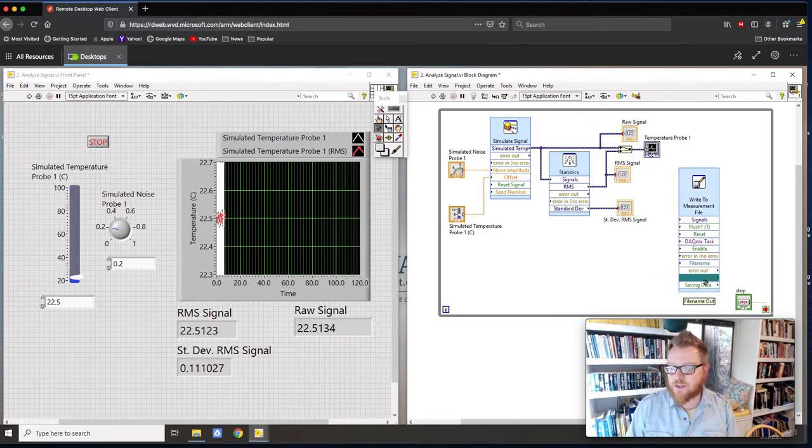And then notice this file name out is, it wants a wire from left to right, because the arrow is on the right-hand side. That's how I know it's an indicator. So I want a control so I can tell it where I want the file to go.